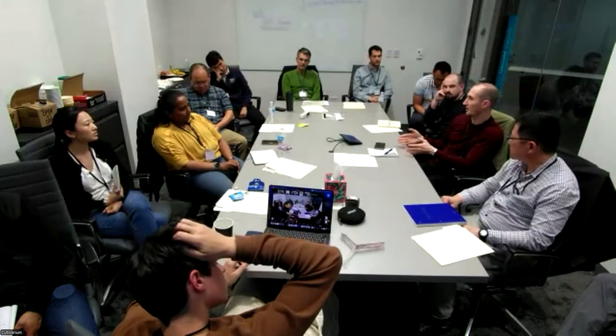If you don't do DDA, you don't care, because you're fragmenting a certain mass range. So that's also the advantage: if you record your data with DIA, you will greatly benefit from software improvements because the data is there. If the software gets better at picking up the data from the noise, then you can rerun your data set. For example, now there's a new version of Spectronaut coming, and they say now we get better quantification data.